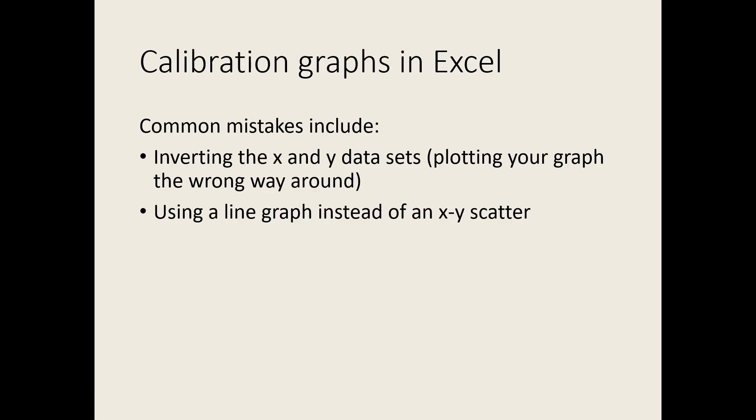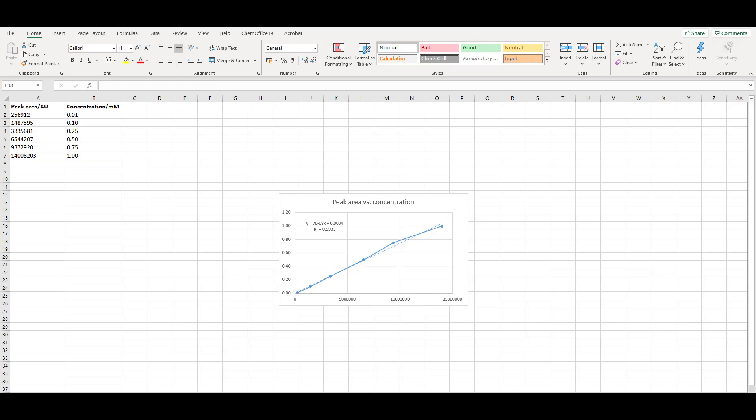Some common errors when plotting calibration graphs include plotting the data the wrong way around and using the wrong type of graph. If the data are the wrong way around, the graph will have the wrong variables on each axis, so you need to make sure you know what you're plotting on the X and Y axes.